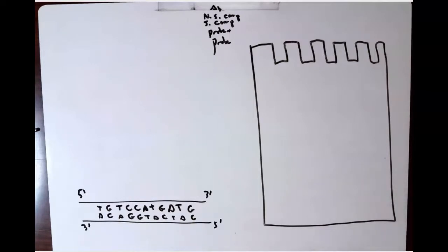So I'm not going to be introducing anything new here, just talking about gel shifts the same way I did in the lecture, but taking time with the explanation so that hopefully it's more clear.